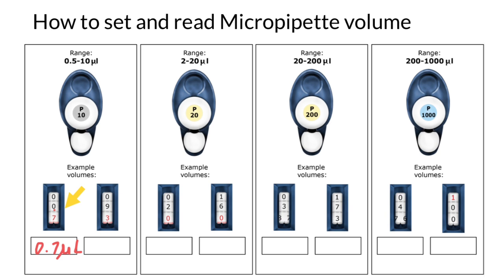Next, these numbers. If you think that this is 93 microliters, this is not so. First of all, because the range is between 0.5 and 10 microliters. So 10 is maximum.